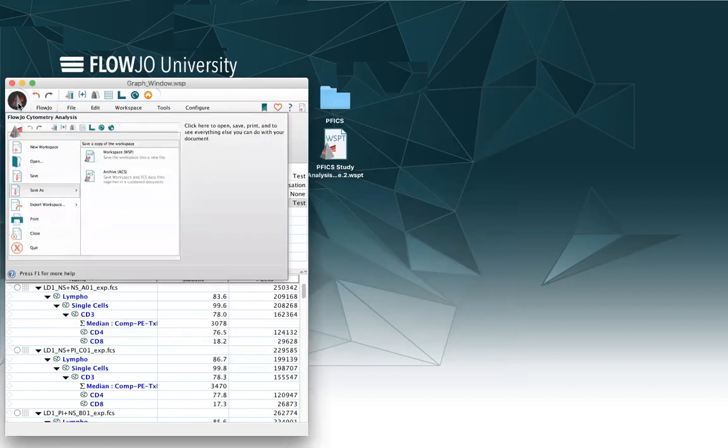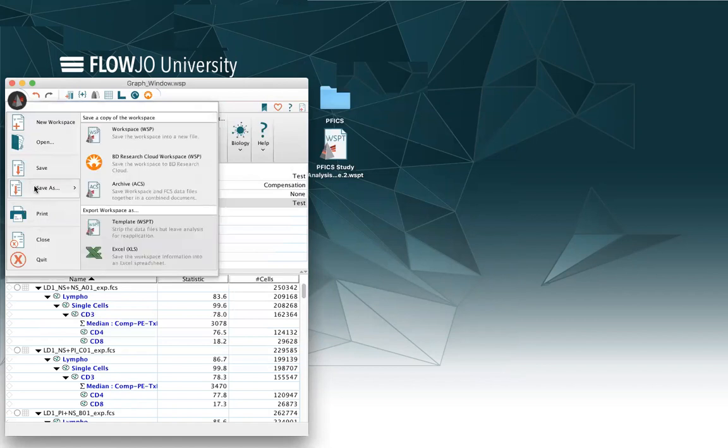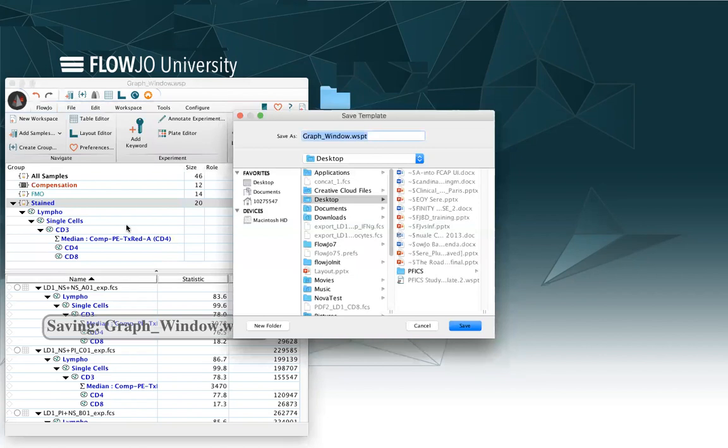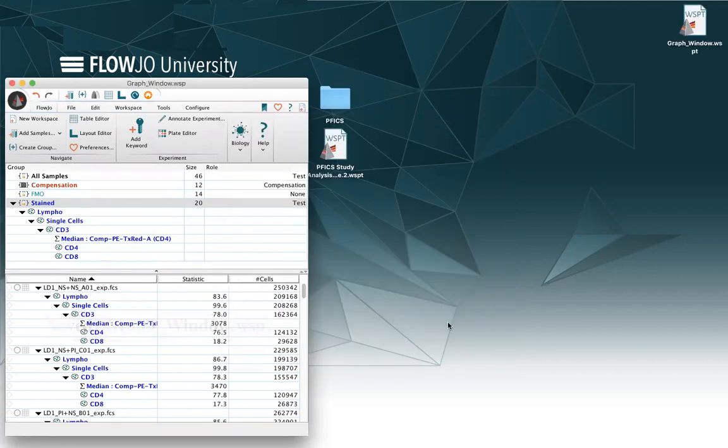To save it as a template, I can click on the FlowJo icon, click on Save As, and select Template. In this case, the name of the workspace will have a final T that indicates there is a template. I can select a location to save it, and click on Save.